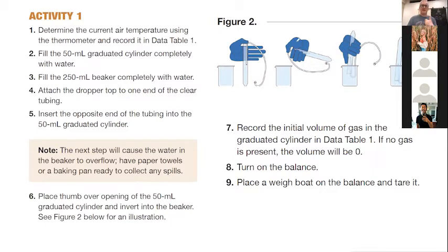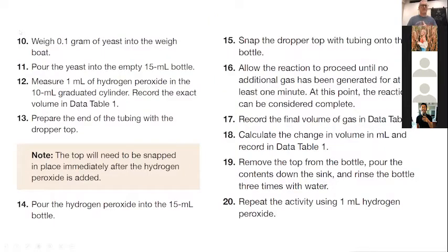Then we're going to measure out a really tiny amount of yeast, like 0.1 grams. Is it important that we get the 0.1 grams really accurate? Yes or no? Is it important we get exactly the right amount of yeast?